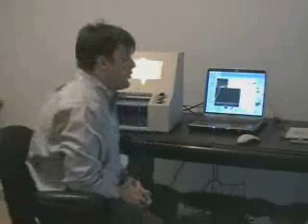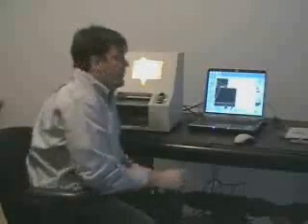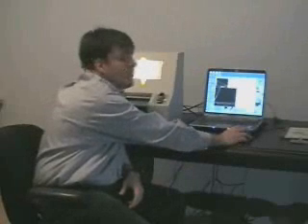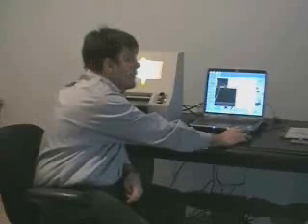Once you type in those 4 letters, lowercase, you will see 2 buttons activated right next to that window: one that says Edit and one that says Advanced Edit. Click on Advanced Edit and a new window pops up. This window should almost never be accessed by you, but for this installation, we need to access it. At this window, you'll see on the top left a checkbox that says Calibration Mode.